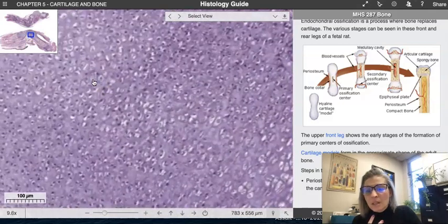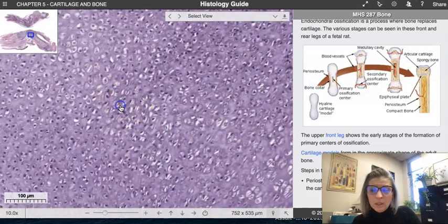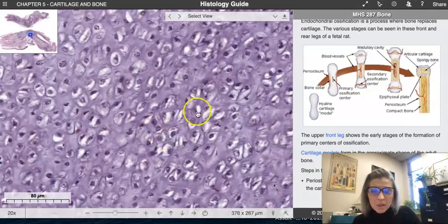And so if we were to zoom in, this would be a great view of looking at hyaline cartilage, right? And so that's something we could even do now. So all of this watercolor wash in the background is going to be your hyaline cartilage. So there's lots of collagen in there, of course. And we can have another whole video for this too. But just as a quick reminder, this is all hyaline cartilage.